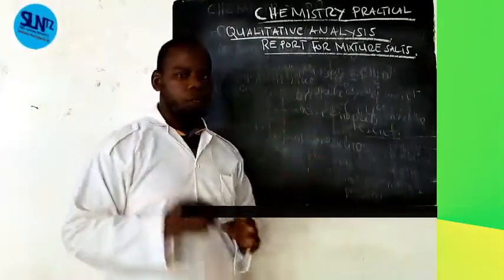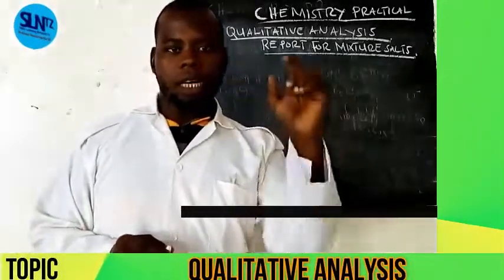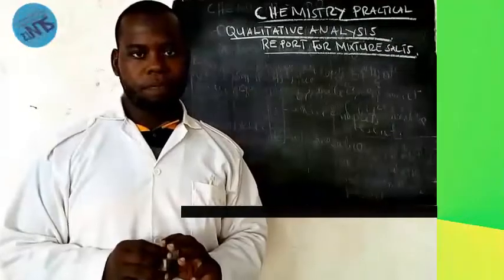Our topic is qualitative analysis: identification of ions, cations and anions. That is what qualitative analysis deals with.